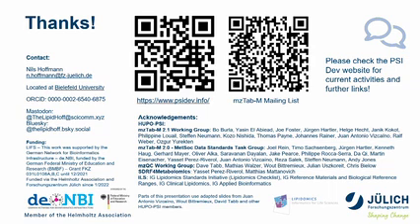Do you see the possibility for MZTab-M to sort of ease upload to these repositories in terms of a direct interface? I think that's a big barrier to entry for the community. Yeah, definitely. We already have a lot of tool developers on board. So MZmine, for example, and MS-DIAL used to support it, and I think we'll also support it in the future again. So if you're using these tools, then you can create an MZTab-M at the end of your workflow. Also with XCMS, we're in the process of doing that. And then you can use MZTab-M basically as a lingua franca, so to say, to do the submission.